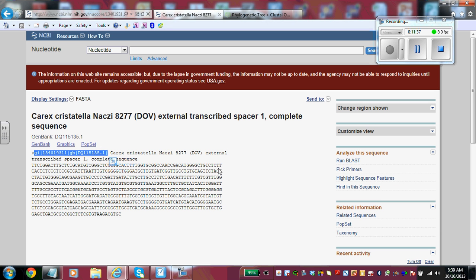HomoloGene complex between a lot of different species that are using glyceraldehyde phosphate dehydrogenase, which is this common enzyme that's used in glycolysis, which we'll talk about, I believe, in chapter 9 of your textbook. And then we're going to use that same concept of using a common gene or common protein to analyze between species for our sedges or our research project that we're doing.